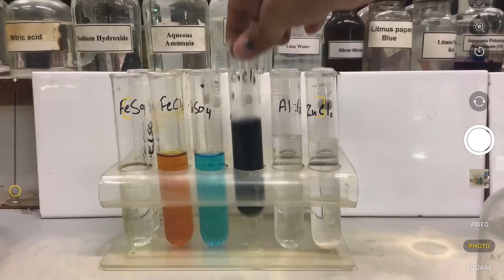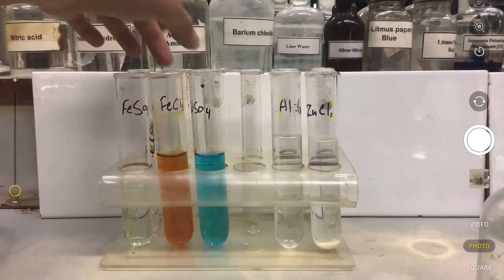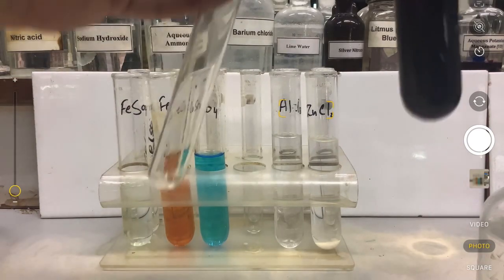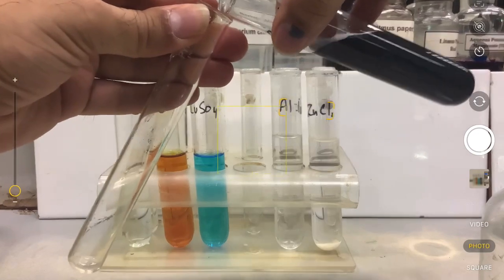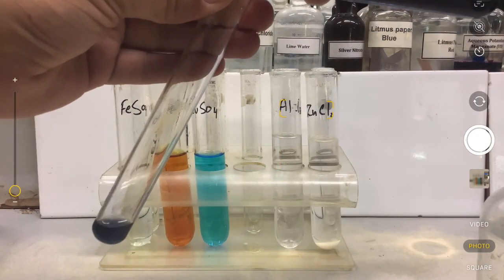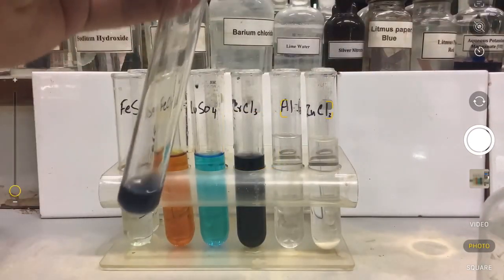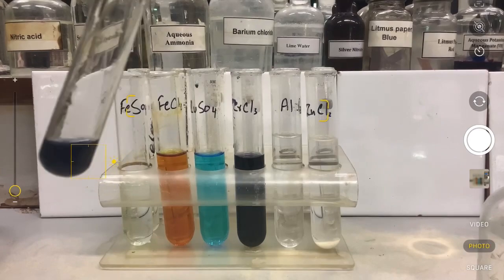Now let's move on and take this new sample which is, I know, chromium 3 ions, but let's suppose we didn't know this. It's a slightly green solution, green-blue, or you can say sea green solution. When you see the color, you'd know that this is definitely not iron 2 green. It's a different green.